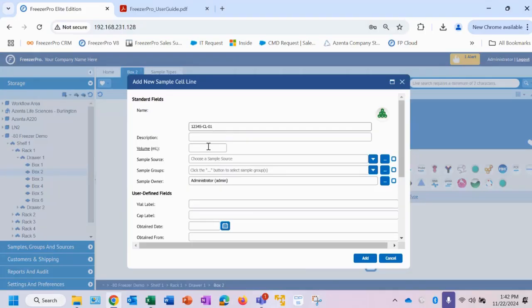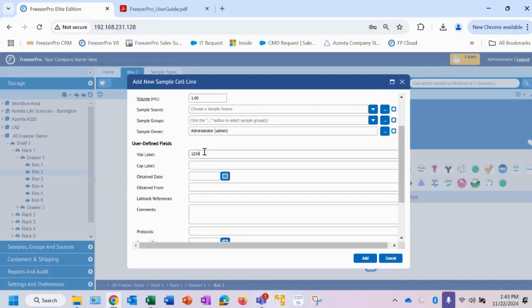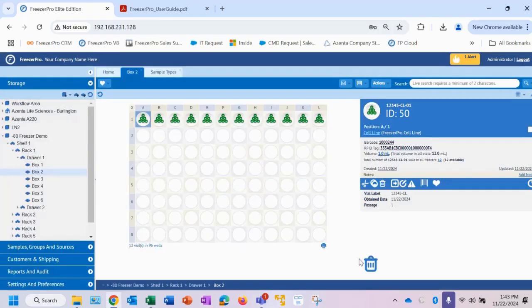But we can see once I've created my sample with some number of vials, I'm going to get a few identifiers that appear. The first is going to be a large ID number, then the sample ID. So if I click across any of the vials or aliquots, they're all going to contain that same number.